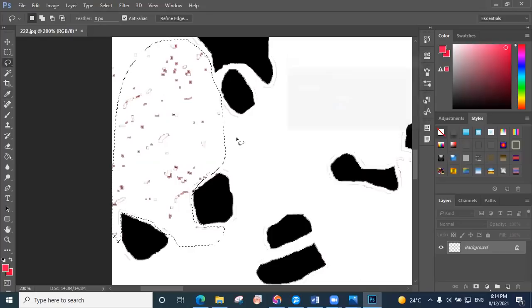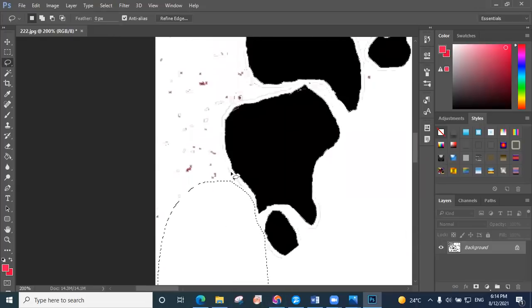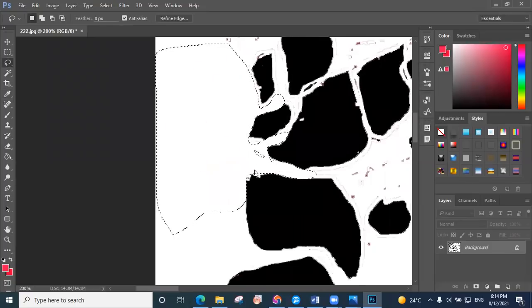You don't need an exact result. You can just skip cleaning the microstructure or the surface and calculate directly without spending time on cleaning. But for getting an exact and correct structure, just follow the steps, and believe me, you will be happy at the end when you get the results.